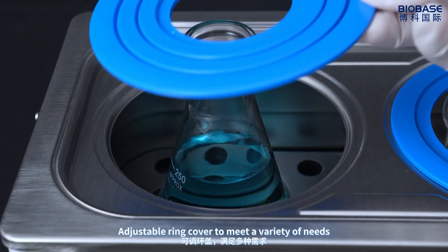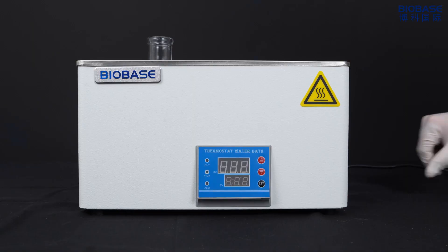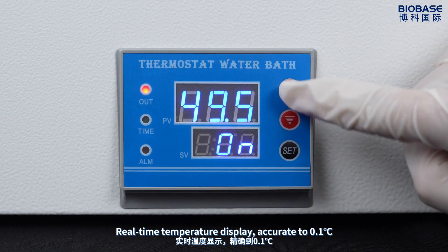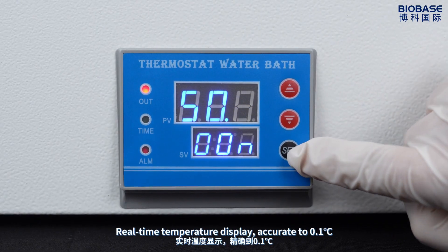Adjustable ring cover to meet a variety of needs. Real-time temperature display, accurate to 0.1°C.